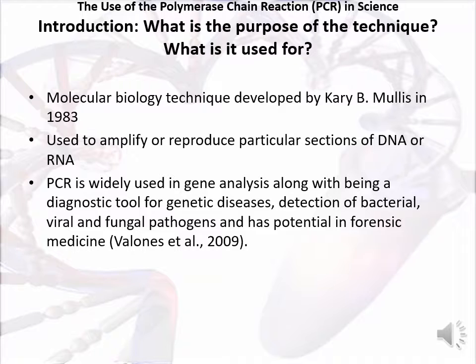PCR is widely used in gene analysis, along with being a diagnostic tool for genetic diseases, the detection of bacterial, viral and fungal pathogens, and it has potential in forensic medicine. There have been recent technological advances improving the PCR. There is also now a modernisation of PCR known as real-time PCR. This allows for the results to be faster and more accurate than the conventional way of testing PCR.